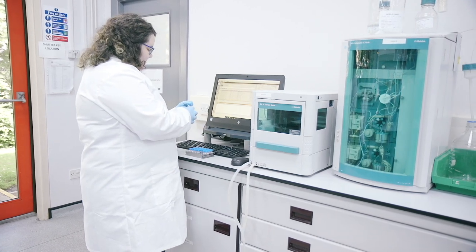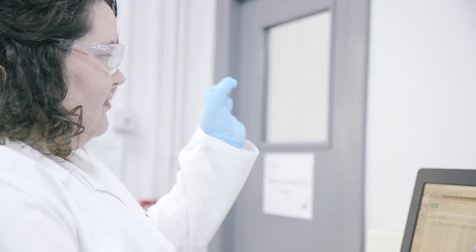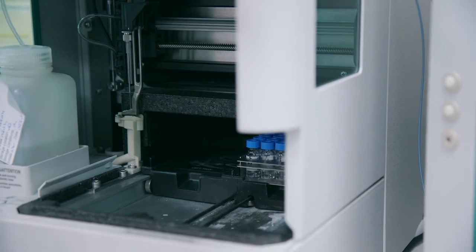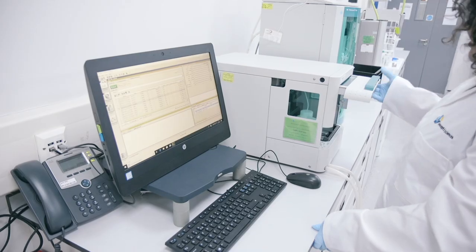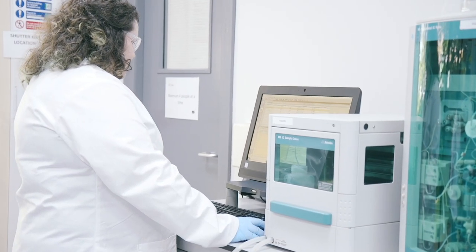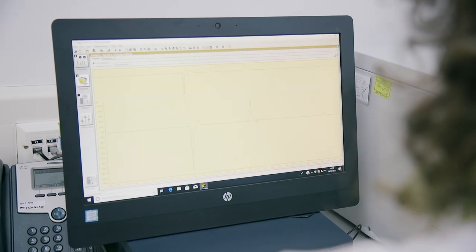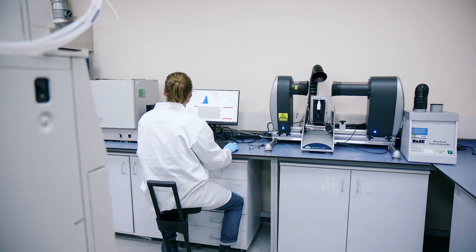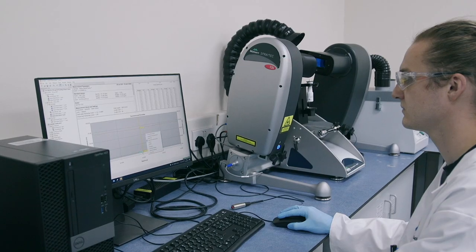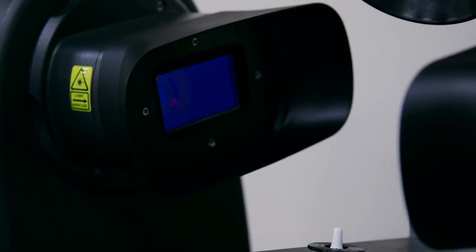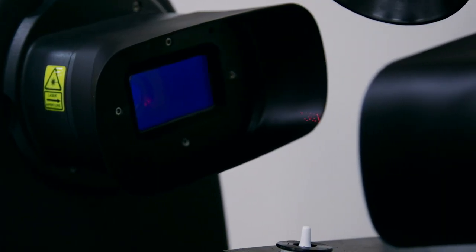Our Metrohm ion chromatograph enables us to quantify cations and anions in test sample materials. This system offers pulsed amperometric detection, which is particularly relevant for sugar quantification. We often use this system for lactose and mannitol analysis. This is the Malvern Panalytical Spraytec, a laser diffraction system which measures spray particle and droplet size distributions as part of product development for sprays and aerosols.